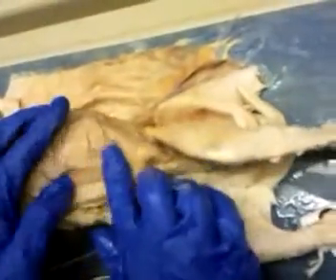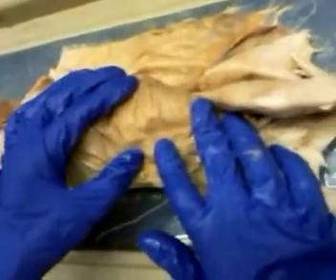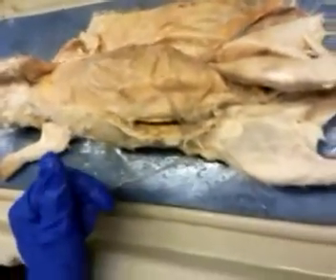Yeah, we're dissecting a mammal, and for the most part, the muscles are the same. It's the posture that's different. Yep. So now, what do I need? Forceps.